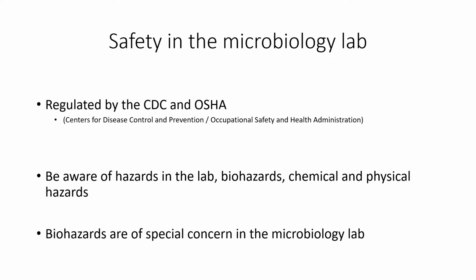We want to be aware of hazards in the laboratory, biohazards such as blood and body fluids, chemical hazards such as sulfuric acid or hydrochloric acid, and also we want to be aware of physical hazards, and that would be trip, slip, and fall hazards such as cords on the ground and things like that. Biohazards are, of course, of special concern in the microbiology laboratory, and remember, a biohazard is something that originates from a living thing.